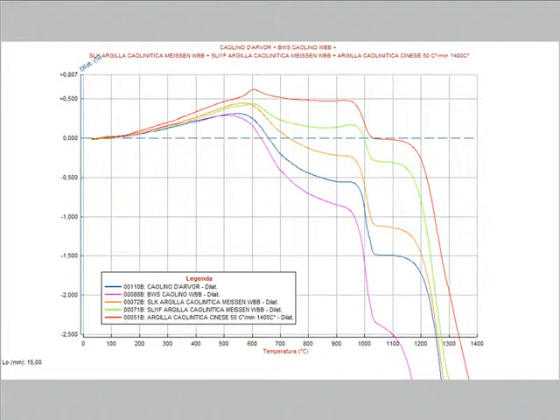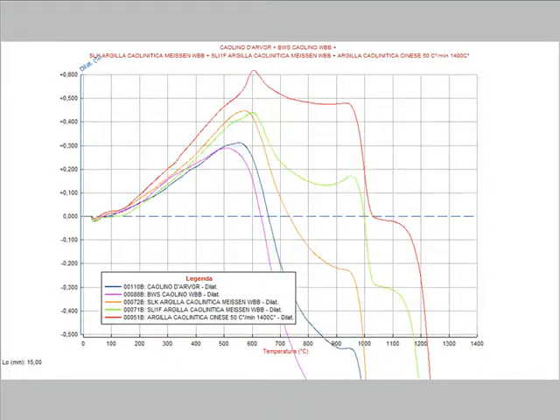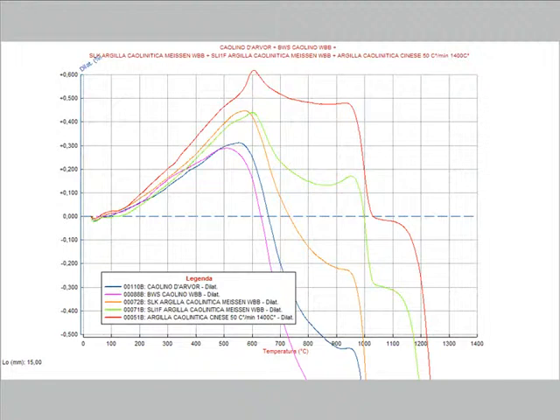Zooming the upper part of the graph, it is possible to have a better evaluation of the differences between the materials. Zooming only the part of the curve with the little fraction of the shrinkage, we can get a result very similar to the one of a traditional electronic dilatometer.